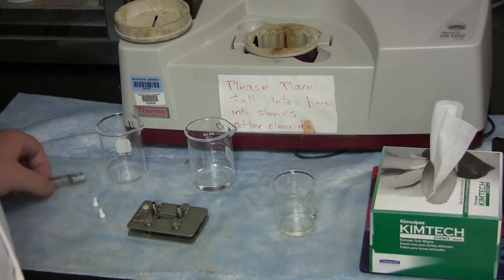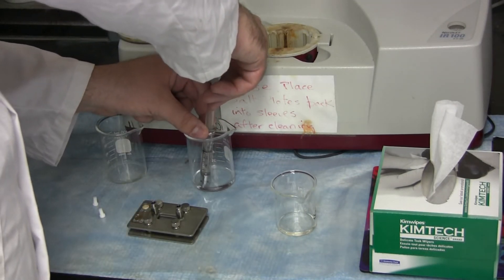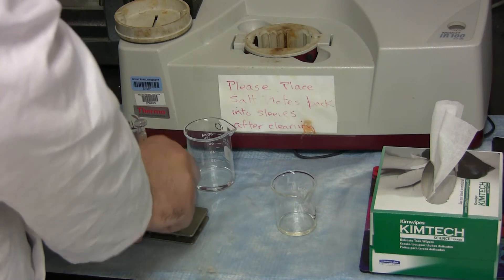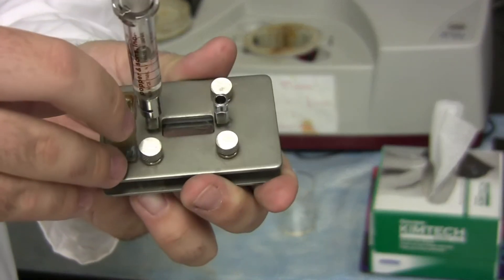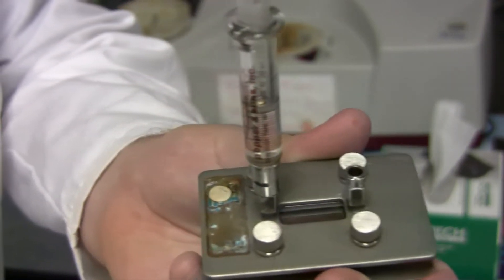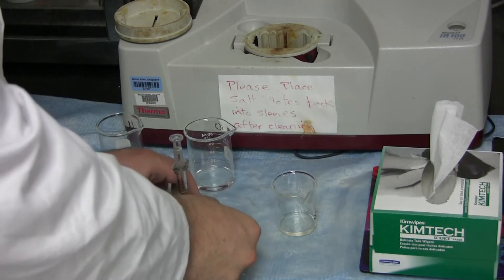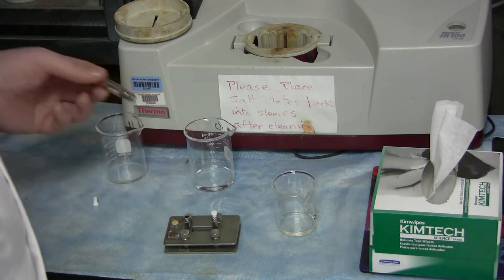Now, once you have drained out your solvent into the waste beaker, use the syringe and withdraw your sample. Screw the syringe onto one side of the solution cell. Again, inject it until you can barely see the solution coming out the other side. Once you see this, you can cap it off. Unscrew the syringe and replace this with a plug.